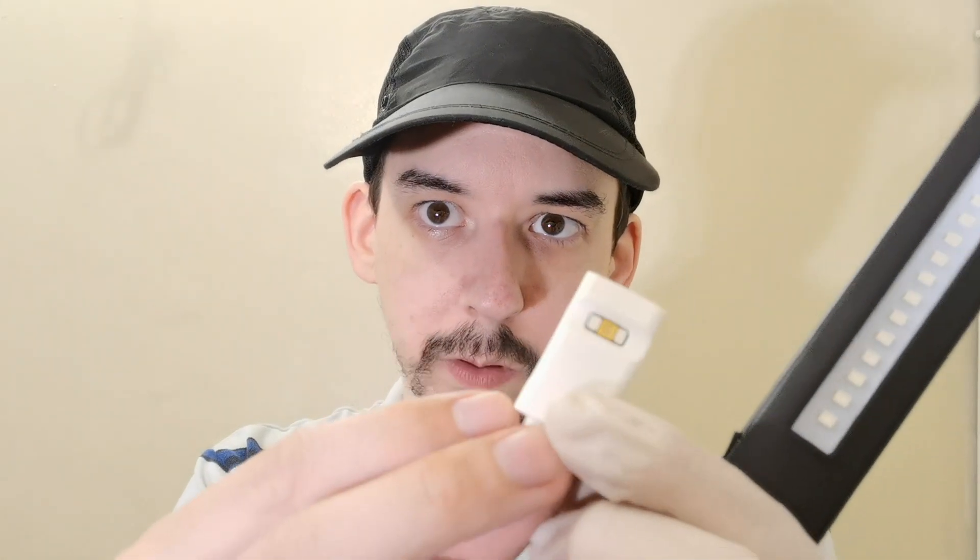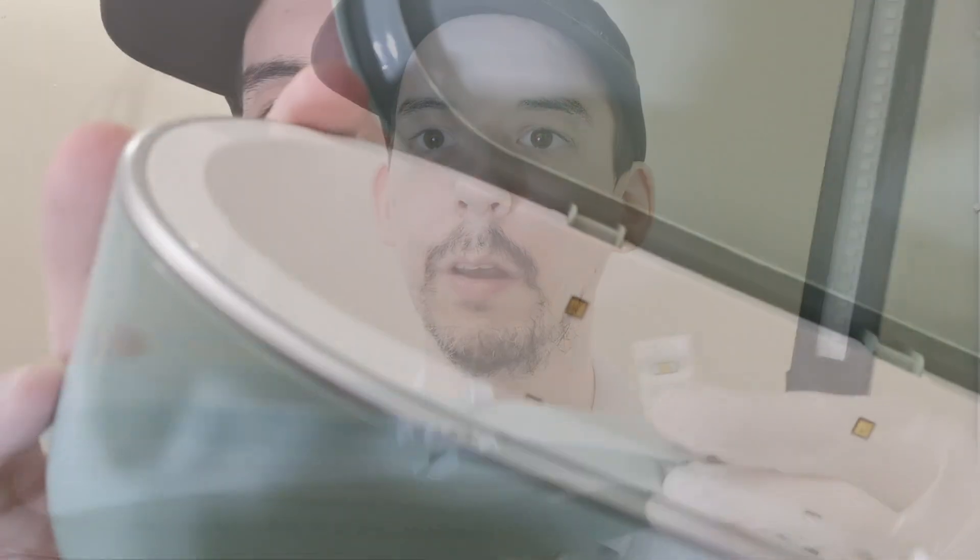The one treated with the genuine UVC wand has just one tiny tiny little growth. So UVC can work, but there are a lot of fake products out there. You can actually see — look here — the LEDs are white. Genuine UVC LEDs are kind of golden in color. You can also see that in this Philips product; inside, the LEDs are a golden color because they're made with special components that won't break down under UVC light. That's a big red flag.